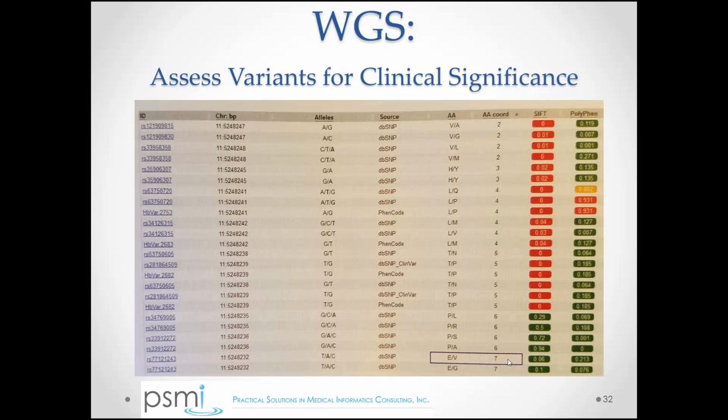They said this is a non-synonymous change. This is a missense mutation where there is a change in the amino acid, but these two software programs did not predict that this particular change would be deleterious. And we were a little bit more conservative in our filtering approach. We simply said, look, if it's a missense or a nonsense, we're going to keep it in our subset.